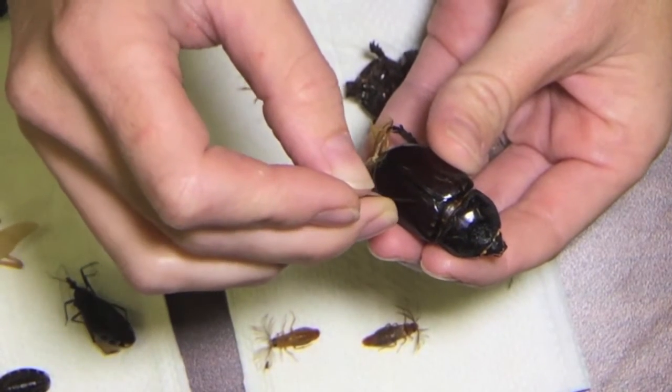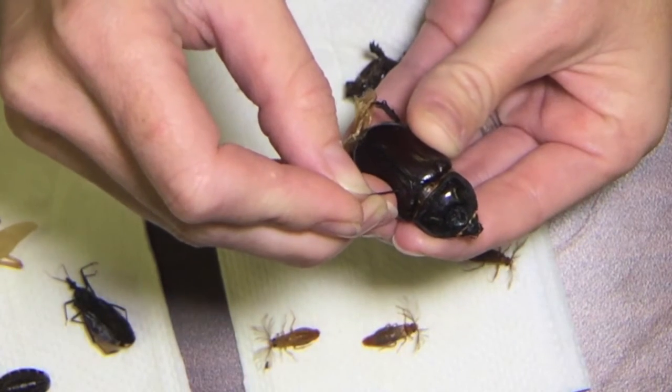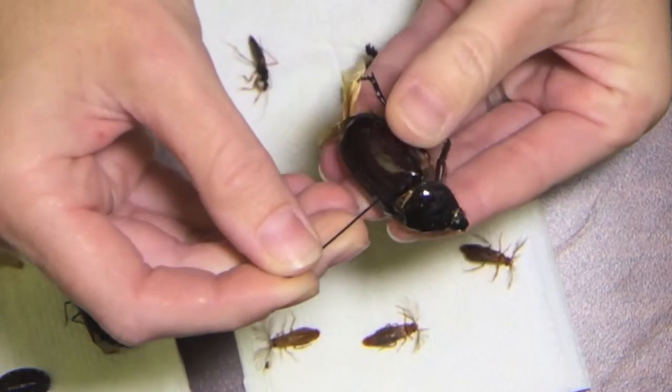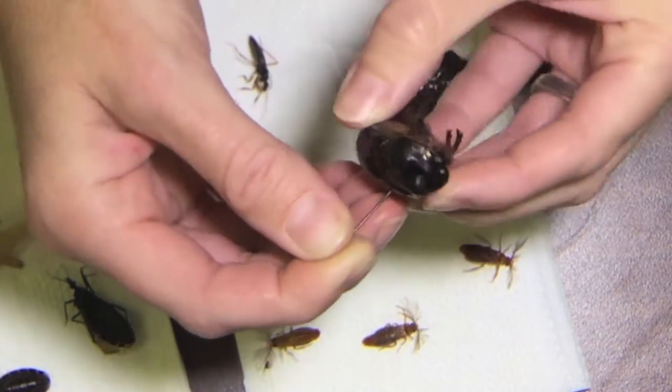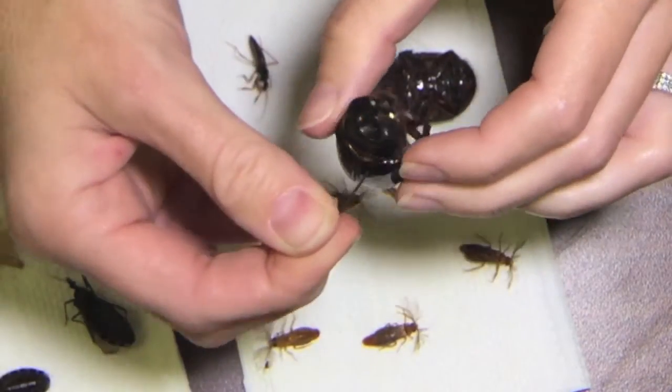I look for the midline or the middle of the insect and I put my pin just to the right of the middle of the insect — the insect's right. I push it through and make sure that the pin is on there straight, that he's not tilted to the left or the right or front or back too much.